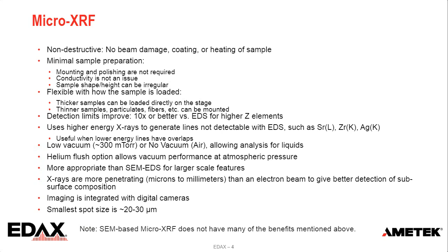This setup can generate high energy X-rays in the SEM, like above 20 kV, but the sample needs to be prepared to put in the SEM chamber under vacuum, so you have to polish and coat your sample. And also for this SEM micro-XRF, the sample size is subject to the limitations of the SEM chamber and stage, so your sample has to fit into the SEM chamber and be mounted on the stage.